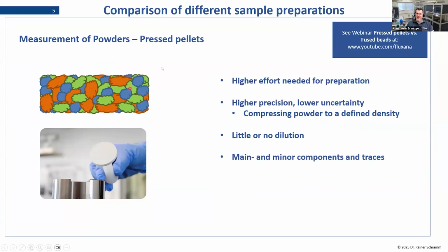The advantage we have is that we get a more defined density, which helps us with the repeatability of analyses. We get rid of the air that is within all these particles. It takes a bit more effort, but it's still very quick compared to the loose powder.